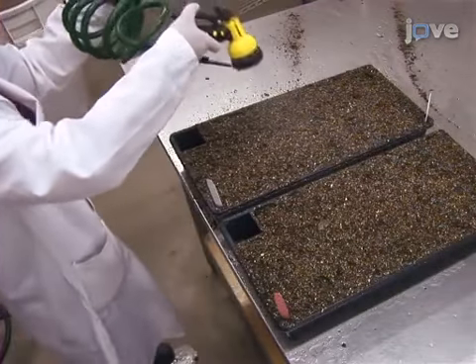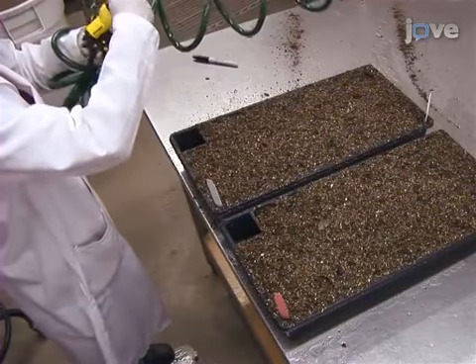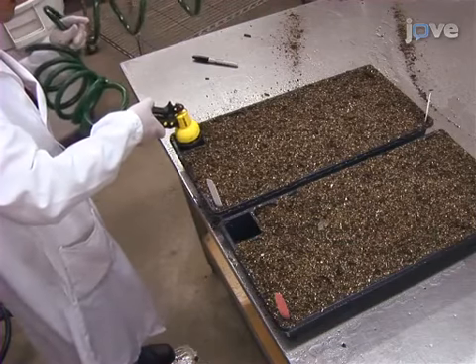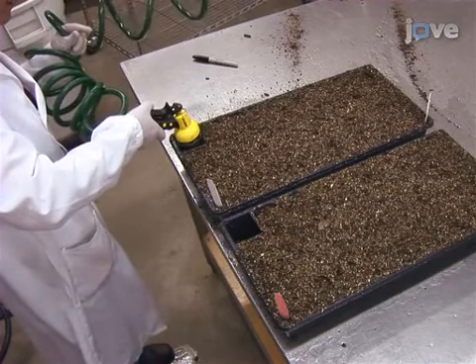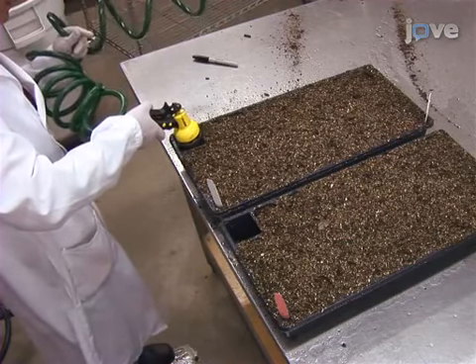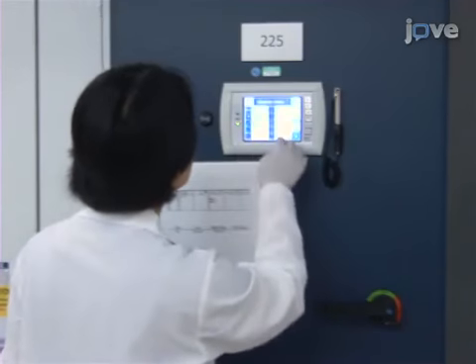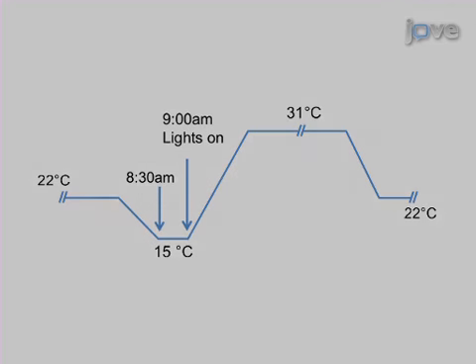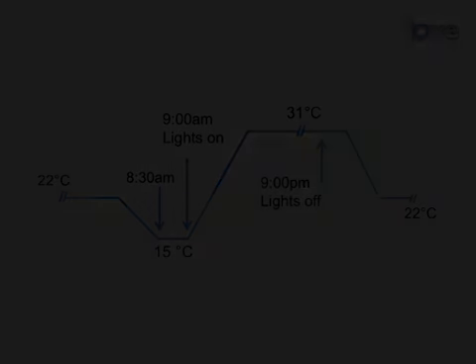Mist the surface of the soil to dampen it and then water flats from the bottom. Keep watering the cells from the bottom one to two times per day after seed sowing, taking care not to overwater. Set the growth chamber conditions to 31 degrees Celsius during the day and 22 degrees Celsius at night, with a pre-dawn treatment of 15 degrees Celsius from 8:30 a.m. to 9 a.m. Also, maintain a 12-hour light-dark schedule.